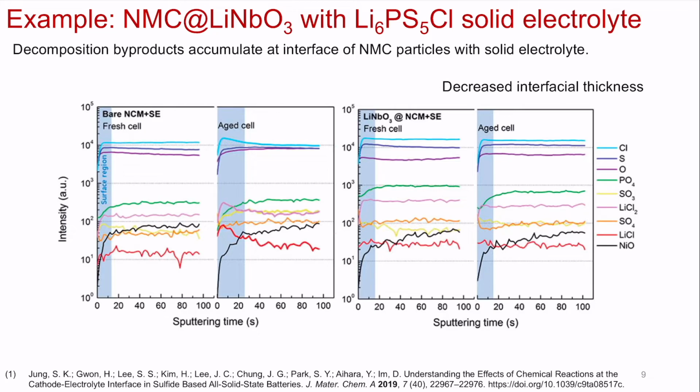So that means that there's a lot more stuff on the interface of the coated one than the uncoated, which is... Oh, the coated. No, sorry. The inverse of what you said is true. Wait, you said the bare? Because the nickel oxide is from the NMC. Yes. So if you start measuring the density, immediately you start aging, that means you're already reaching the cathode.